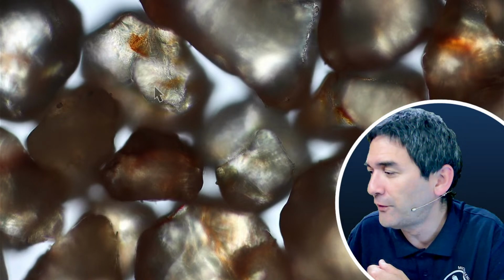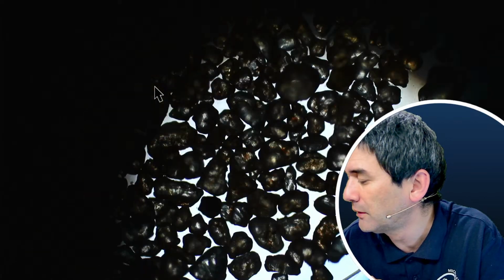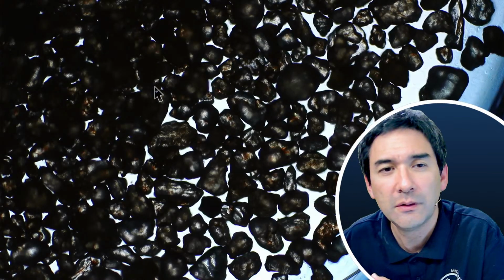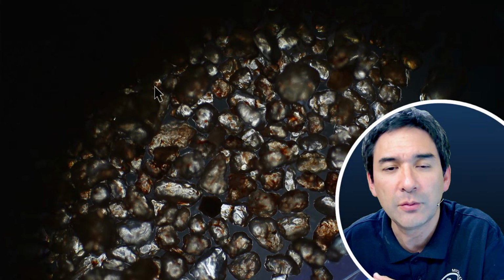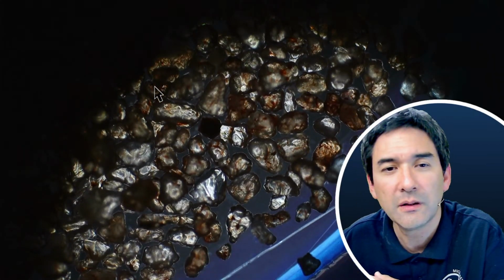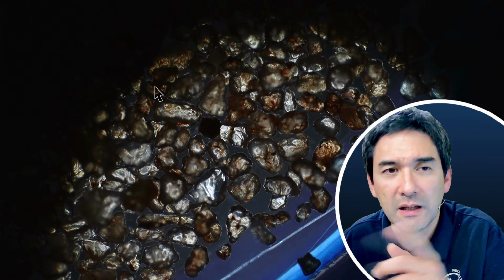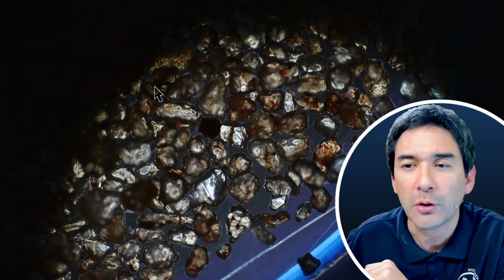Can you use dark field? Okay, this is something that I can do using the low power 4x. I only have dark field with the low power. This is now... No, I have to use it like this. It's not quite centered, but that would be dark field. The image is not quite centered in the software. That would be dark field.